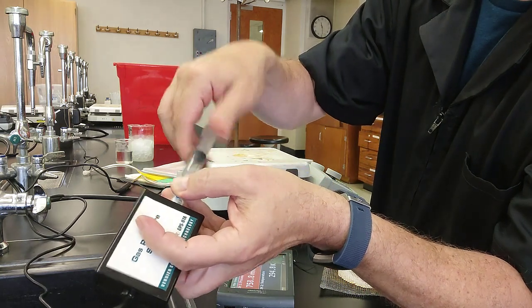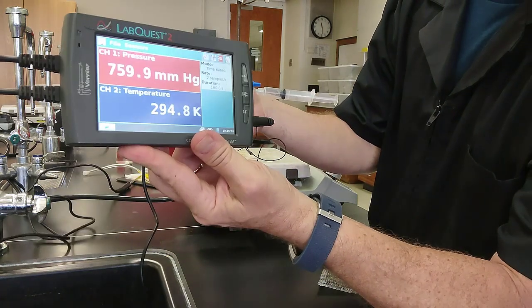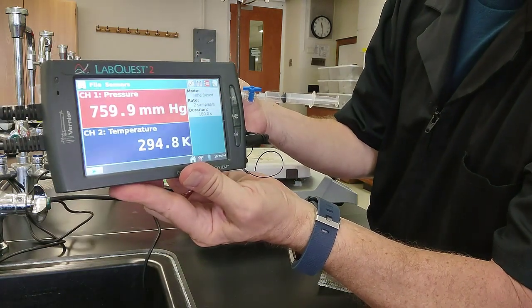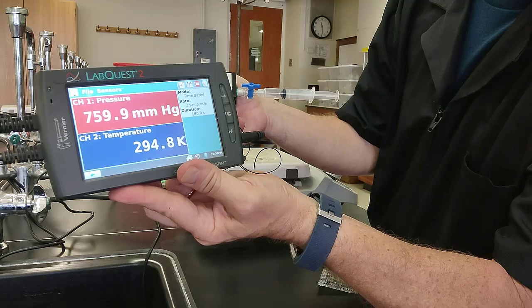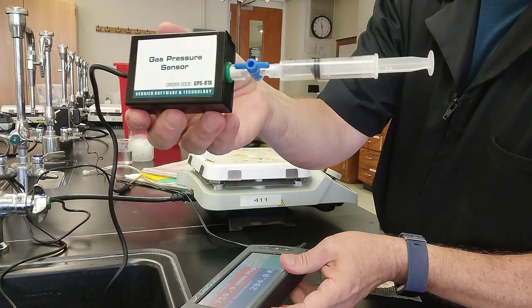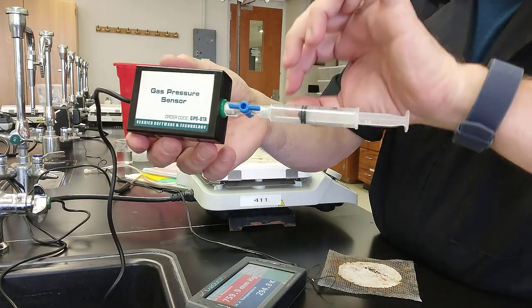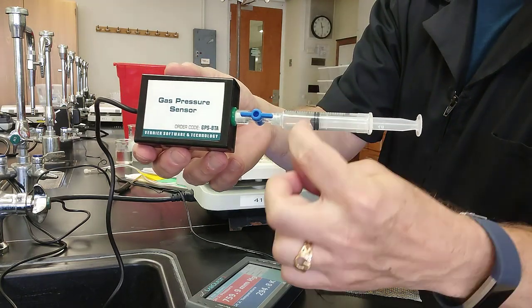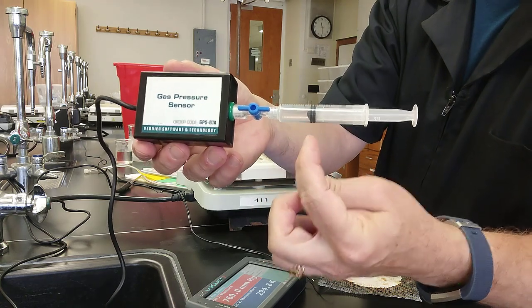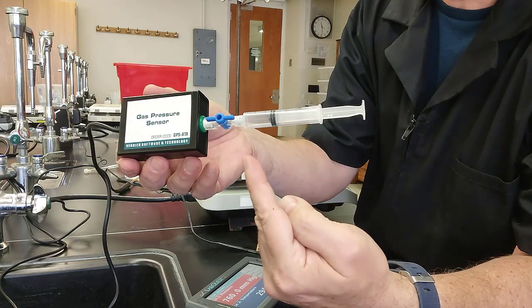And so right now, our pressure sensor is reading really close to 1 atmosphere, 760 millimeters of mercury. Right now we're at 759.9. Ooh, there we go, 760. I haven't done anything to my syringe, right? I just threaded it on. So the pressure of the gas inside my syringe is the same as my pressure in the room.